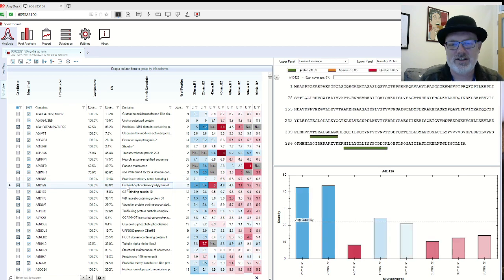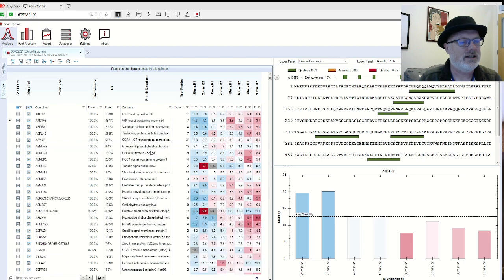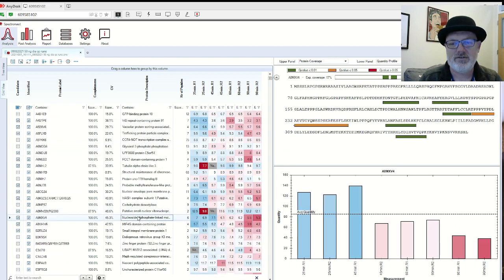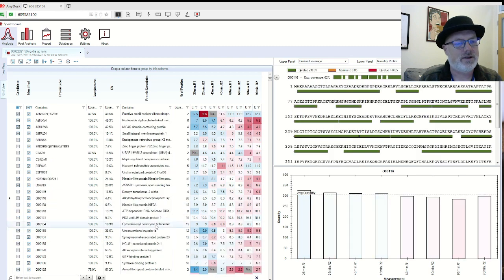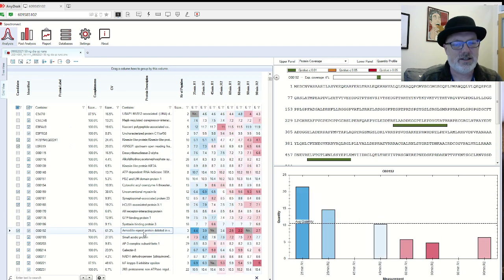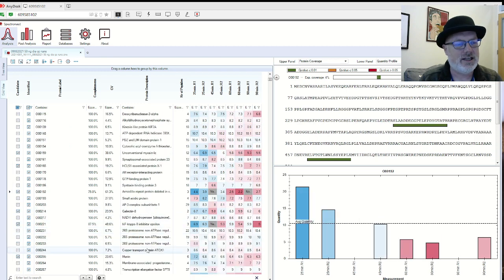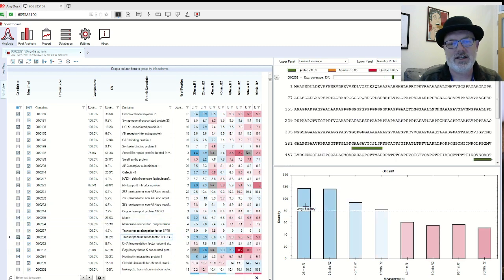Okay, so let's see. This is interesting. Why would it do that? Okay, so this one looks like it's actually higher. You get more response for this protein in the 25 than the 90. Why is that exactly? We could probably look at things where we can find the opposite. And remember, the 25-minute run did not have enough scans across the peak. And you can see how we get NAs now, huh? Where we didn't before. That's interesting.